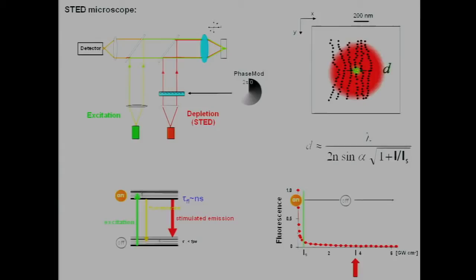It means we can tune the spatial resolution. We can adapt the resolution to the problem. If you grab more molecules, you can be faster because you don't have to make such a denser pixelation, since you switch off fewer molecules on average. That's the point. Or, of course, you can have a higher spatial resolution. But from a conceptual viewpoint, there are two things. This concept showed you can overcome the diffraction barrier by playing an on-off game, as I like to call it.